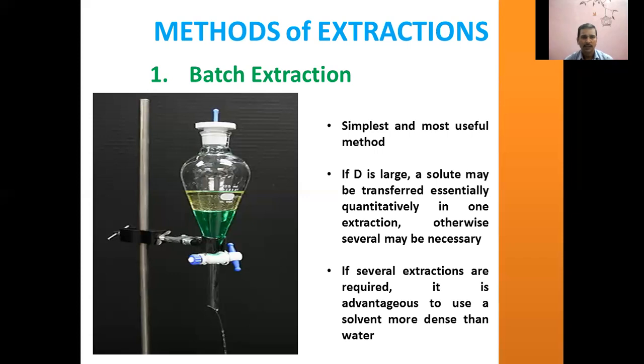These extractions are usually done using a separatory funnel. These types of extractions are called batch extractions. So in batch extractions, we use a separatory funnel, and the aqueous sample solution is transferred into the separatory funnel.